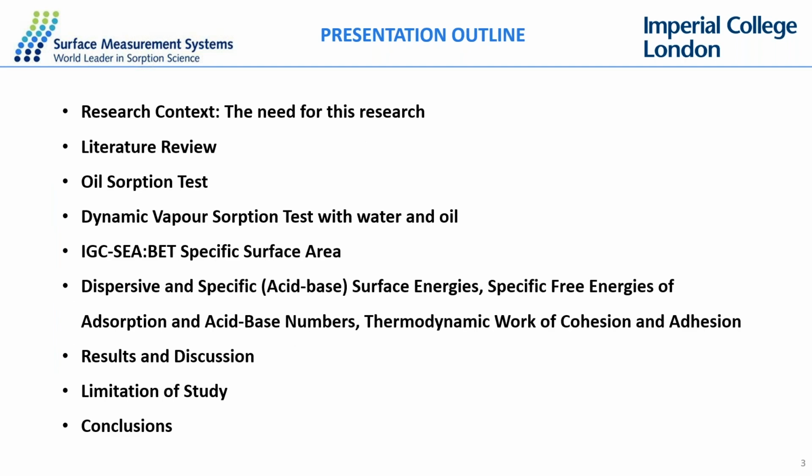For the research context today, I'll be reviewing a little bit about chicken feathers, then I'll go through the tests that have been done before, which are the oil absorption test and also the water solvency test. Then I also look at dynamic vapor sorption tests with water and oil, and then look at the IGC results, which have also made a huge impact in this entire study.